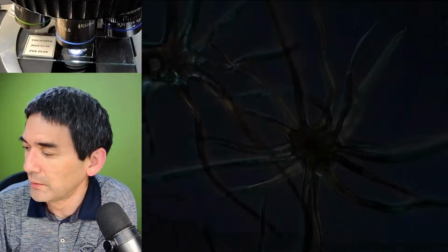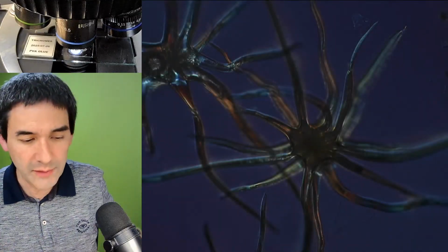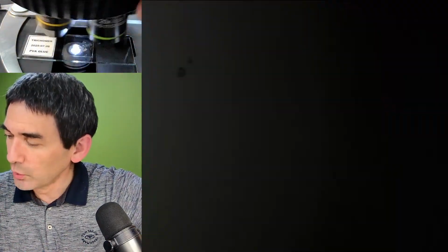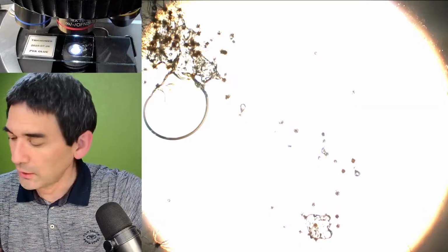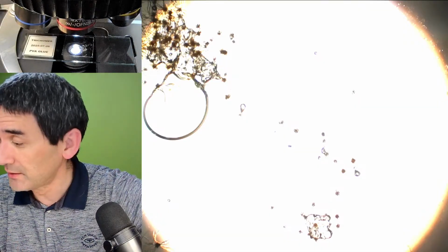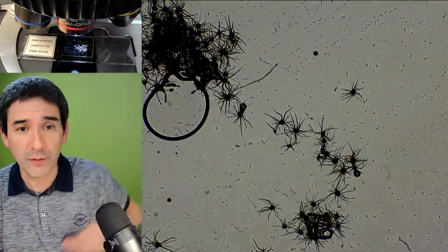So again, over here. What we can try to do, however, and this is also something that only works with the low magnification, and I did not try this yet, okay? So this is now with no polarization. So this is now the 4 times.